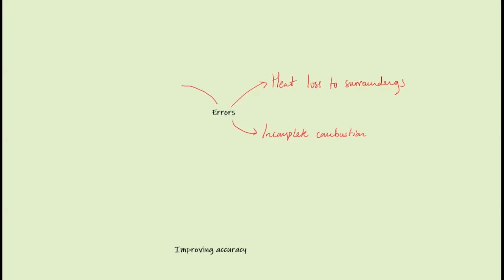This is a bit of a strange one. You might not have heard of this. This is flame disturbance. Now, flame disturbance basically means if you have a flame, that's a dodgy looking flame, but there we go. Okay, on a burner, that draft coming through kind of moves that flame around. That's flame disturbance.